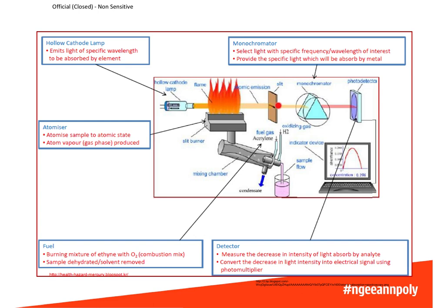The light then exits through the slit and enters the monochromator. So the monochromator will select that specific wavelength at which the atoms absorb radiation. Then they would reach the detector where the intensity of the light would be measured. So to conduct an experiment, you would first put a blank as a sample and then use standard solutions with different concentrations. With that, a calibration curve can then be constructed. This calibration curve can then be used to measure the concentration of the sample.